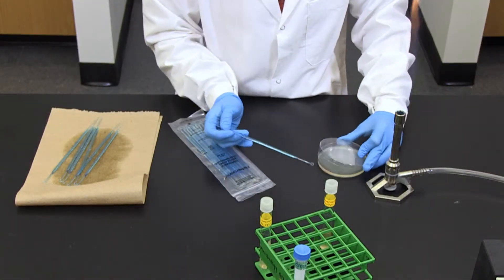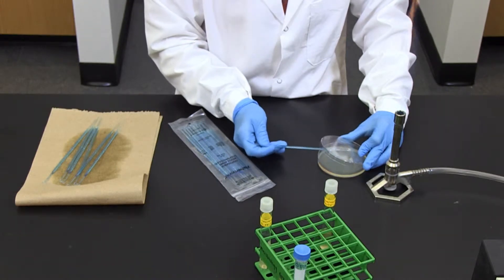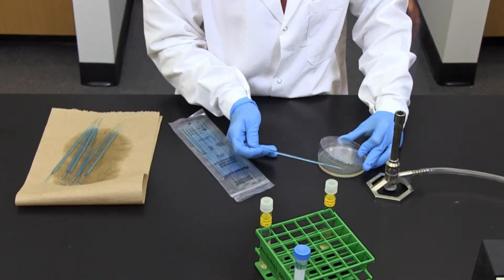From the edge of area 1, make 7 or 8 straight streaks to the opposite side of the plate with a sterile inoculating loop.